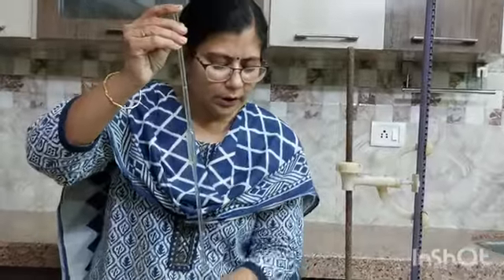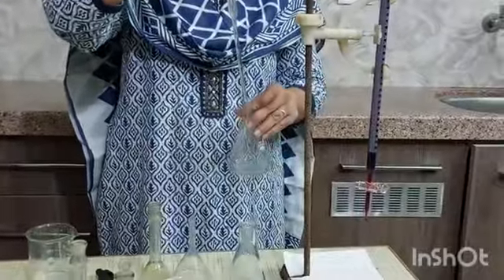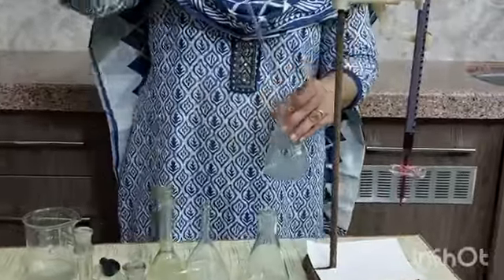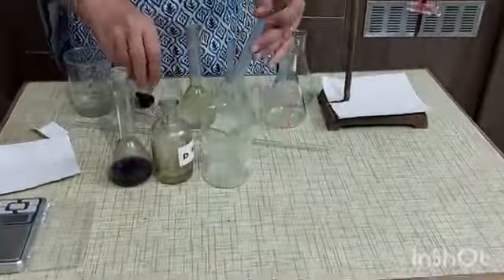Pour this 10 ml of ferrous ammonium sulfate into a clean conical flask. And then add 2/3 test tube of dilute sulfuric acid.